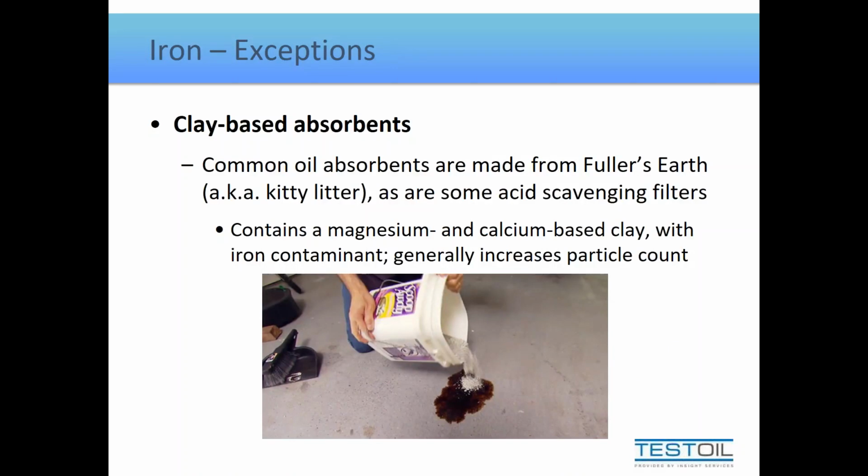And this type of material is very small. It will float through the atmosphere relatively easily, ingress through most breathers, caps, whatnot. And when it gets into the system, it is an abrasive particle. It will lead to future wear. And as I indicate here, it generally does increase the particle count. So if you work at a site that you know uses this product, and especially when you use it liberally around pieces of equipment, it would not be uncommon to see increases in iron due to the use of this product and its ingression into the system, rather than assuming that the iron is directly wear material from parts within the machine.